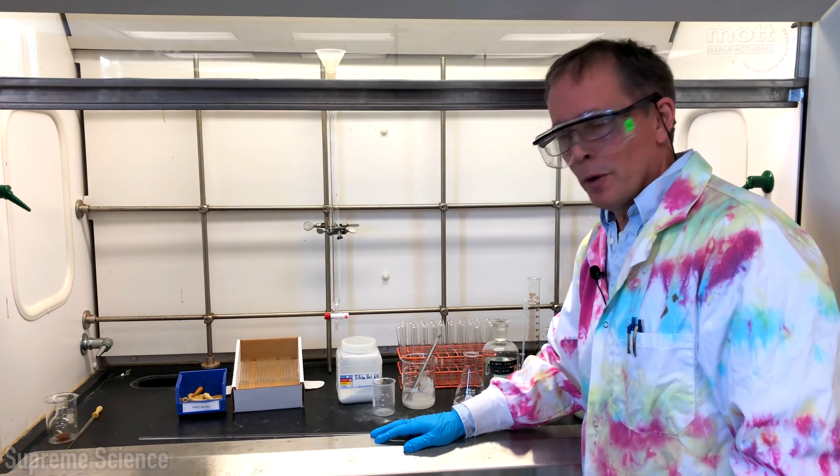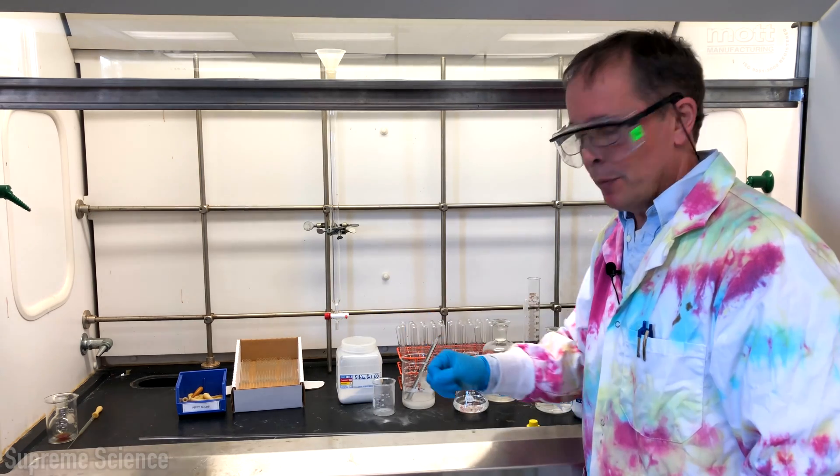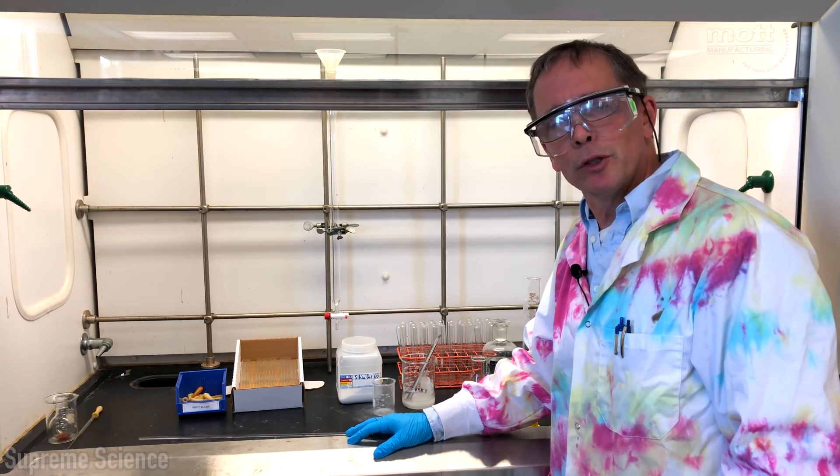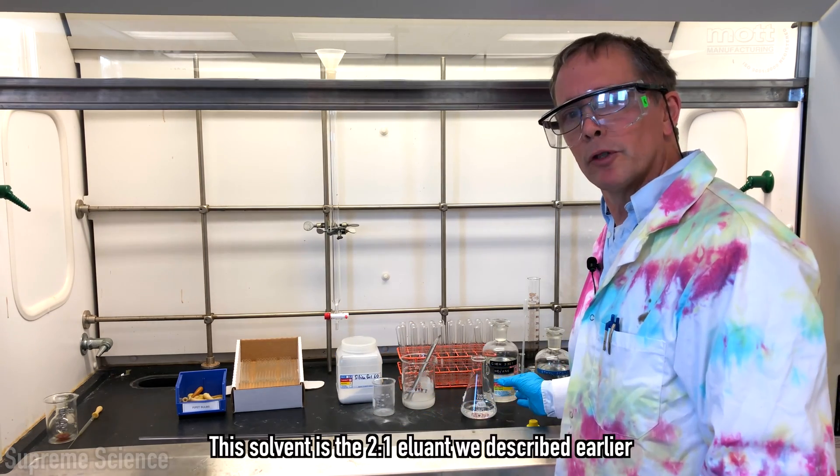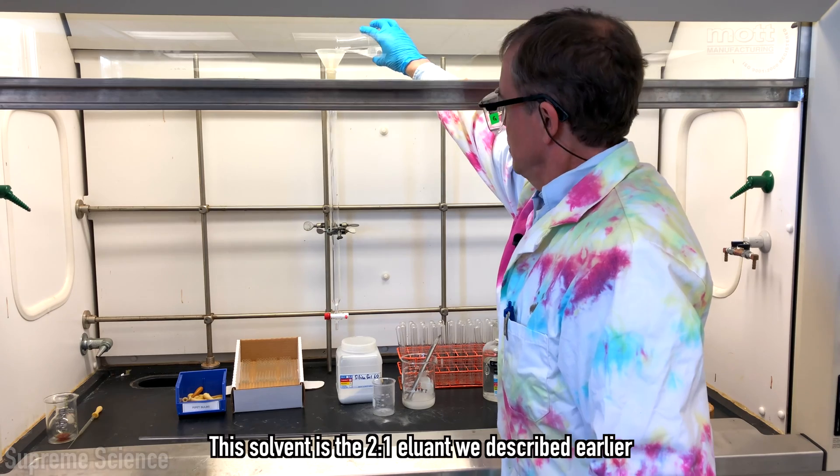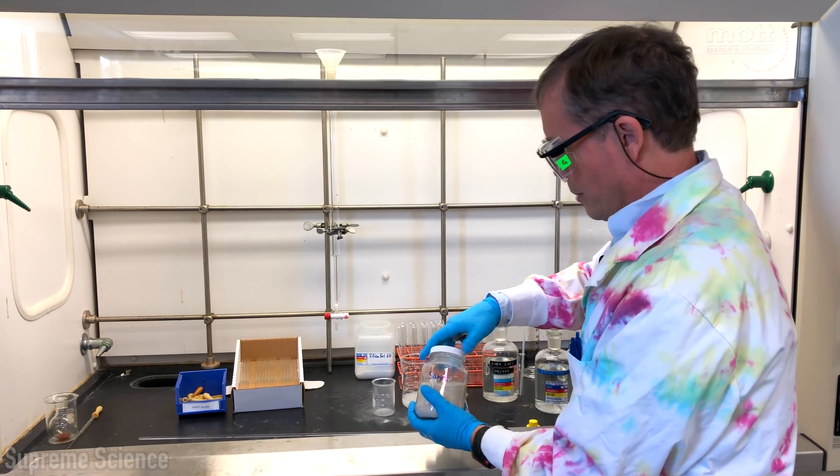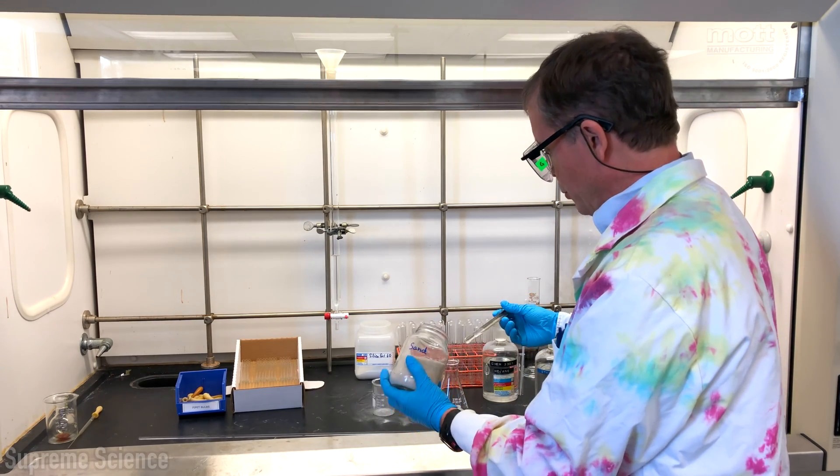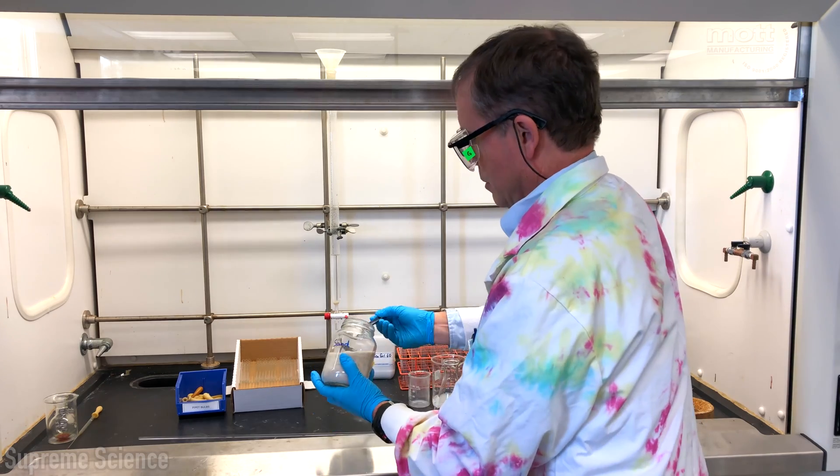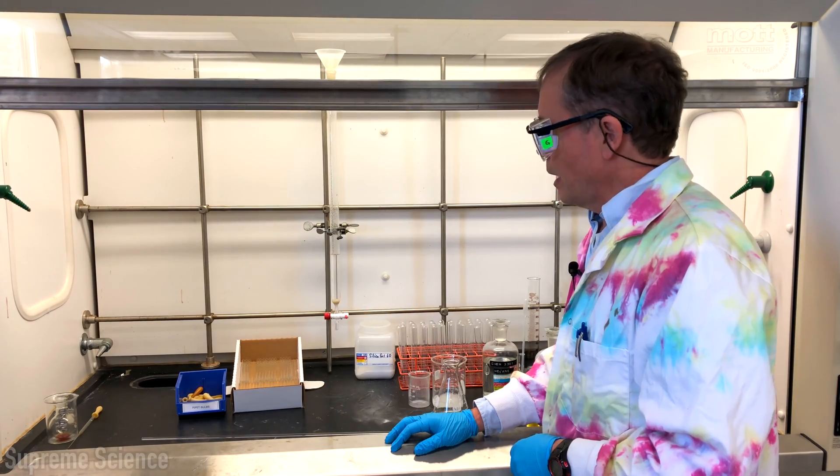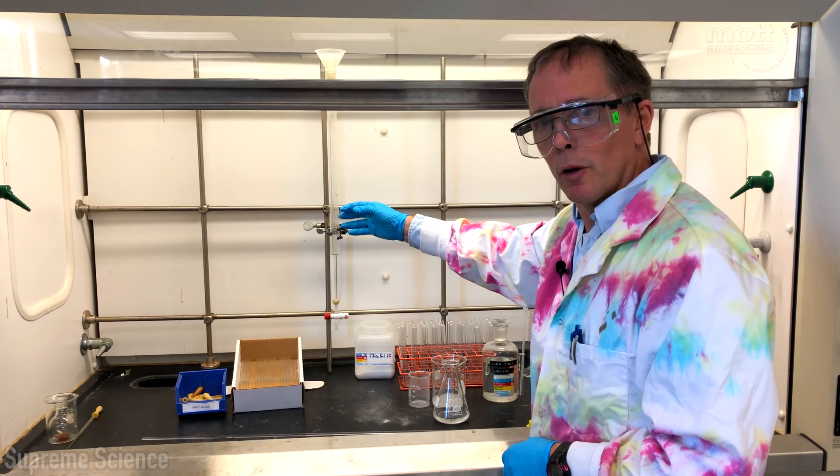Before we add the slurry to the column we have to ensure that we have a glass plug at the bottom which we've already done and add a level sand bed on top of the glass wool which we'll do with the help of solvent. We've used about 15 or 20 mils of solvent. I'm now going to put the sand in through the top. I'm now going to rinse off the sand that's stuck to the side of the column using our solvent mixture.